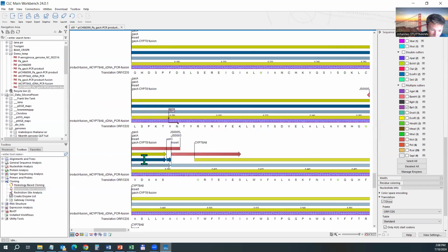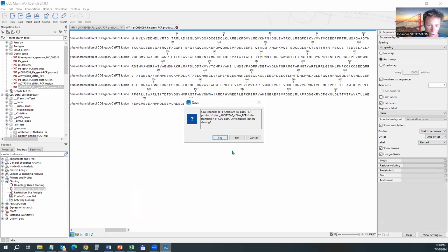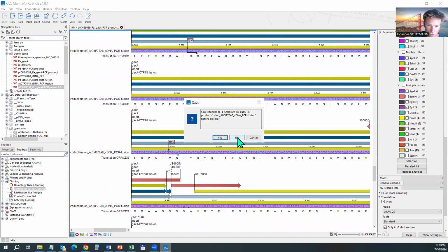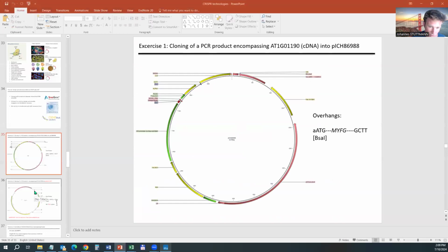And if I mouse over the long fusion protein that I've just annotated, I see that everything is all right. So I have my serine alanine linker, and everything still is in the right frame. And I can of course also now start translating this to see what I get as a protein. That's beautiful and useless. Anyways, so that much for some more or less simple Golden Gate cloning. I could just go back to this PowerPoint.